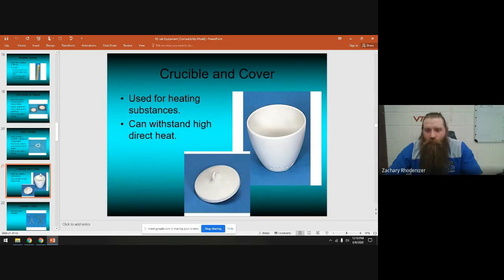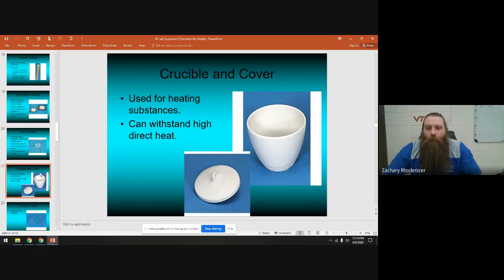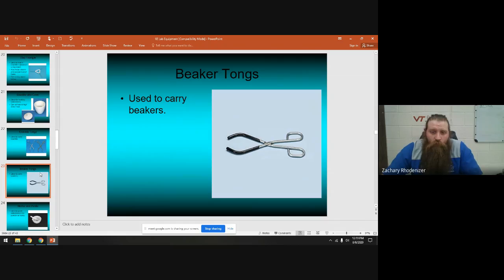A clay triangle is used to hold a crucible. The crucible fits right down inside the clay triangle, which sits on the ring and suspends the crucible for heating. Crucibles are made of porcelain — they break and crack very easily, so be careful. We use them to heat things to very high temperatures to dehydrate them. Crucible tongs should only be used with crucibles, and we'll demo how to use them in class.